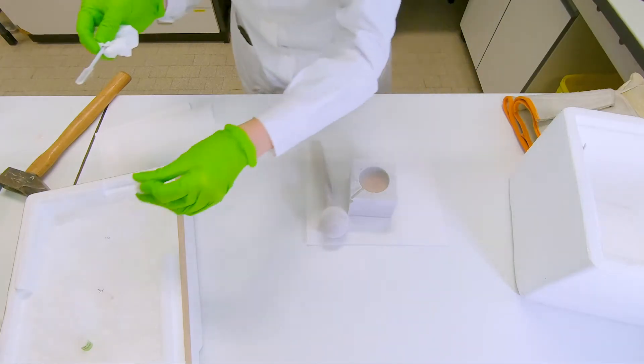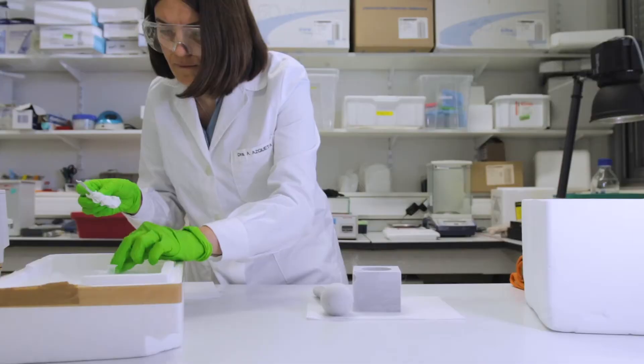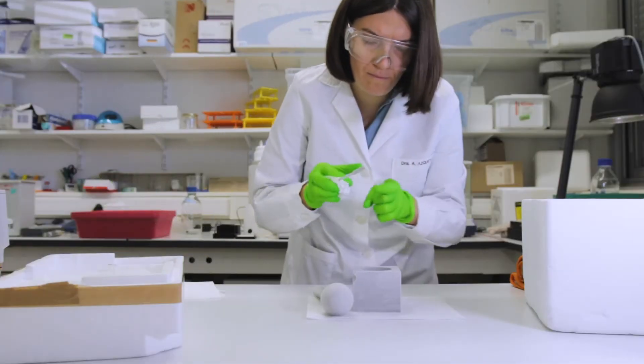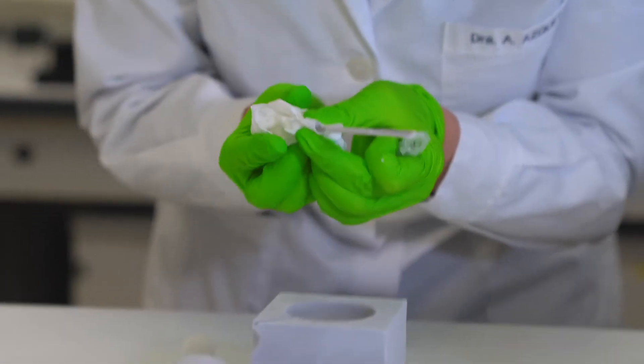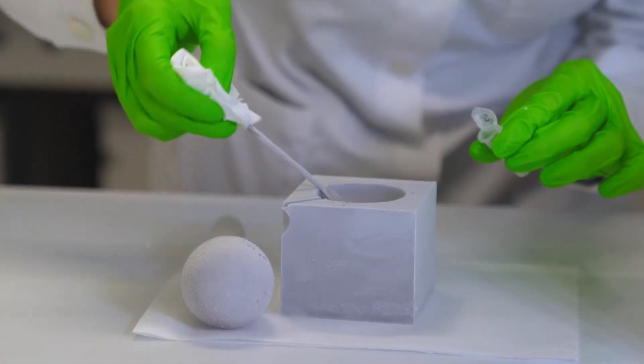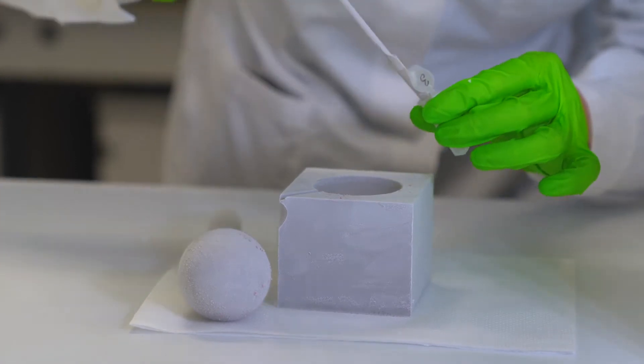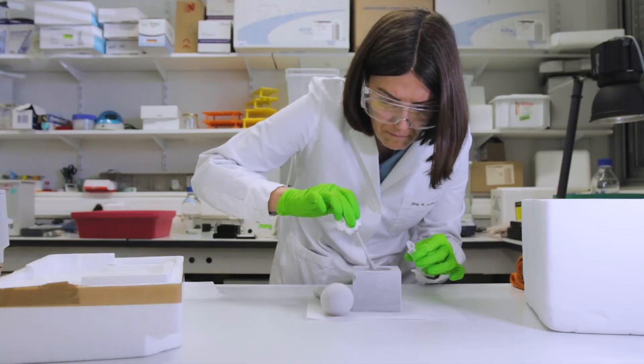In case the spatula would catch too much humidity, you can either wipe it and put it back in the liquid nitrogen, or you can take another spatula. I usually put a second spatula in the liquid nitrogen, just in case as a backup.